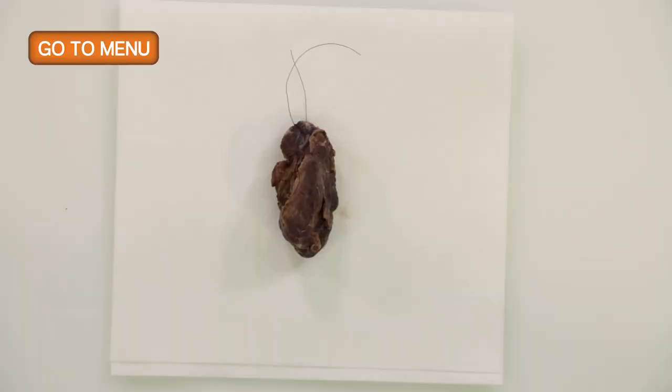Hi, my name is Dr. Teresa Scognamiglio, and this is Kartik, who is one of our first-year residents. And today we'll be going over the grossing of a hemithyroidectomy specimen.